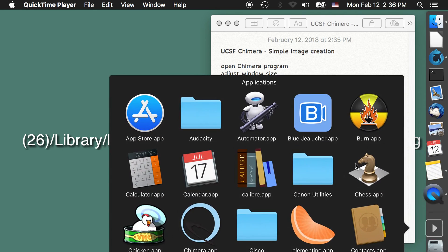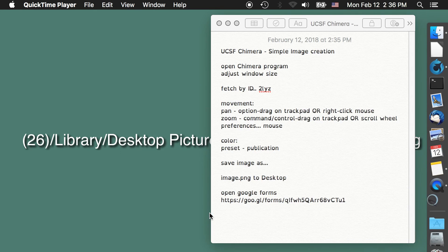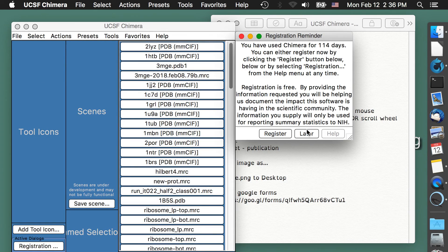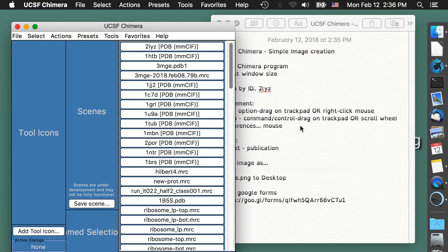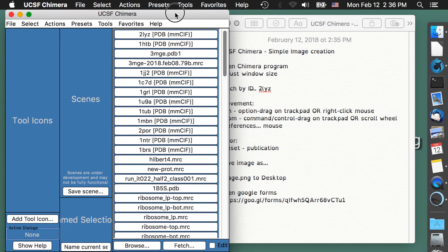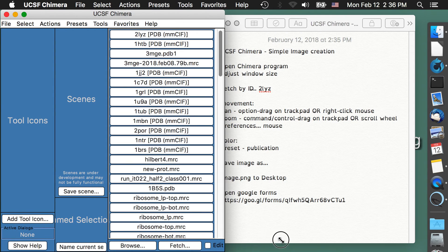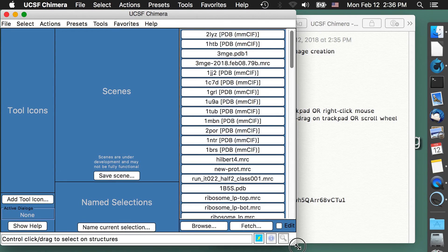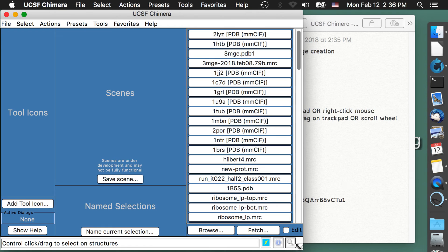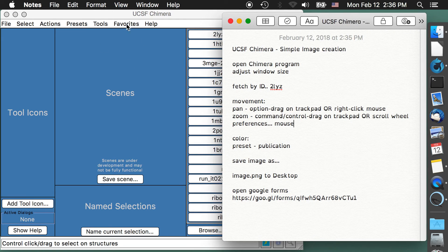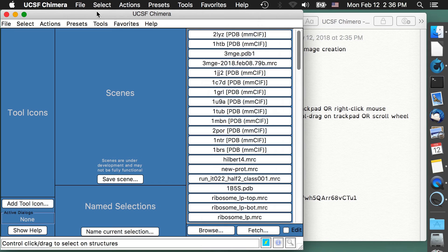The first thing we're going to do is open Chimera. Please register — I've registered so many times it doesn't really matter at this point for me. Then I like to get the window about square, because a square window will produce nice square output images for uploading later.